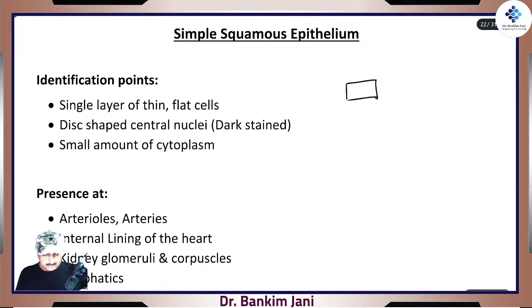Why I'm showing you this beforehand is that on the day I put the microscope here and attach the camera, I'll show you the slide, we focus on this area, and immediately go to 40x. You will see these types of cells, then we move to 100x, and immediately you'll start appreciating it. If I tried to explain these things by putting the real slides for the first time, it would take a hell of a lot of time.